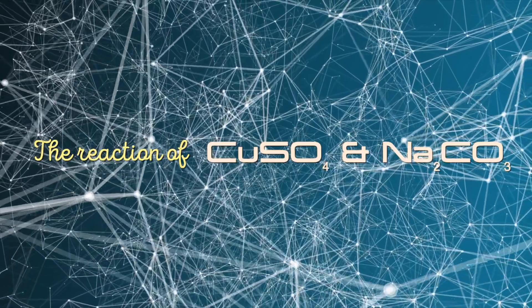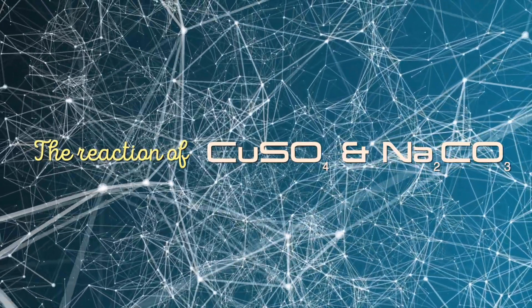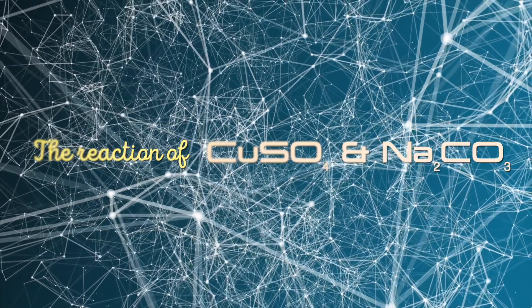Today we are going to observe a chemical reaction between copper sulfate and sodium carbonate.